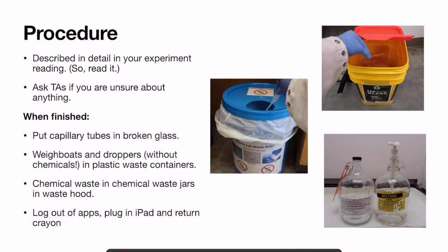A couple reminders concerning safety. Please put capillary tubes in the broken glass, not in the trash, because when the custodians or student workers empty the trash, if there's glass in there and they're unaware of it, they could get poked, and that's not a good thing. Weigh boats and droppers go in the blue bucket that's by your hood, and make sure that you're putting them in there without chemicals.